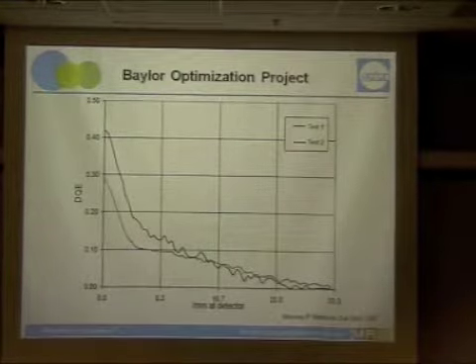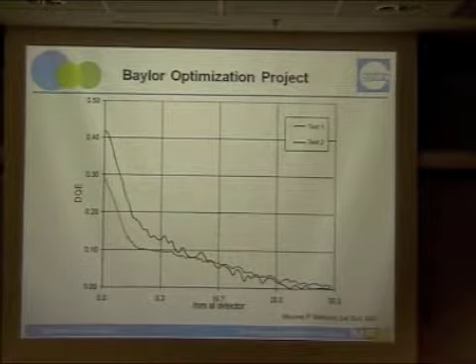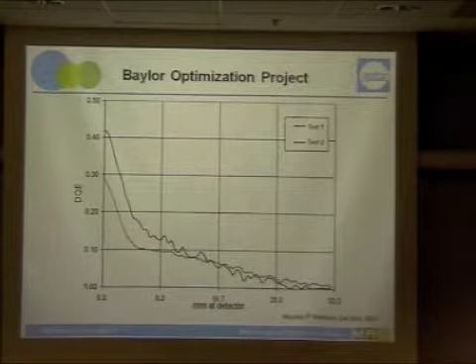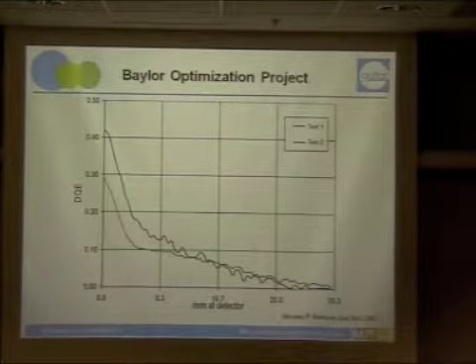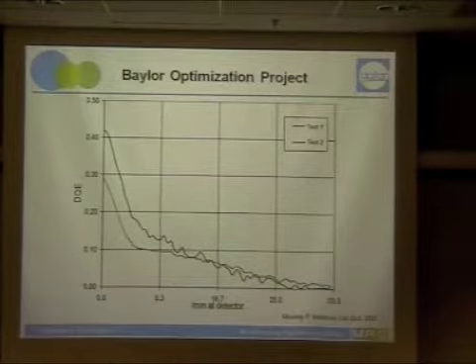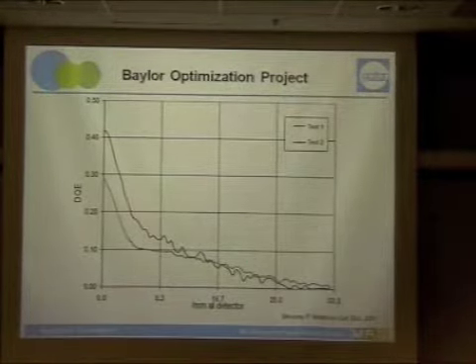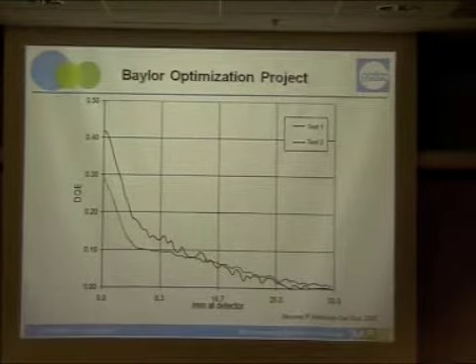Okay, so from this point, we worked closely with this group, and we had a challenge that we needed to create a CCD camera that would allow this kind of imaging at 300 kilovolts. And so internally we had a bunch of cameras being produced, and we made careful measurements of different parameters in the camera, and we evaluated them all using this DQE term. So using DQE, we came up with a camera that we thought would be really ideal for this particular application.